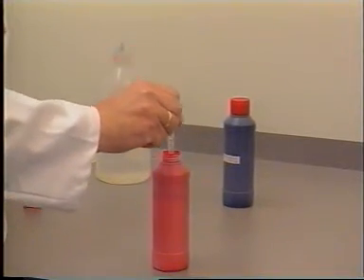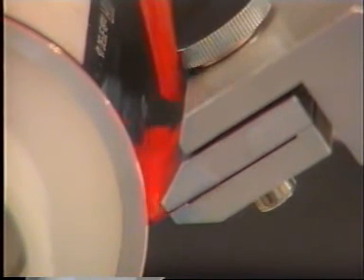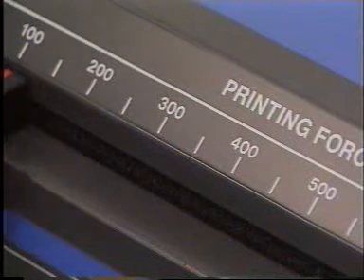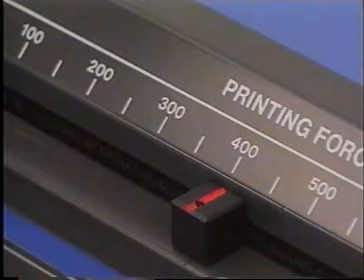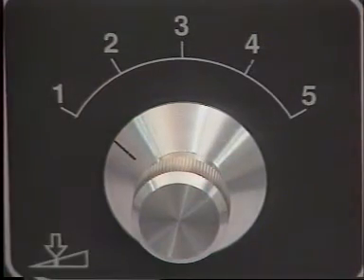It is important that a print can be made which resembles actual practice in density and printing quality. The printing force setting depends upon the nature of the ink and substrate. The printing speed is selected on the basis of the viscosity of the ink used. Initially the following settings are recommended: printing force 400 N at a speed of 0.2 metres per second. Depending upon the printing result, the settings are altered.